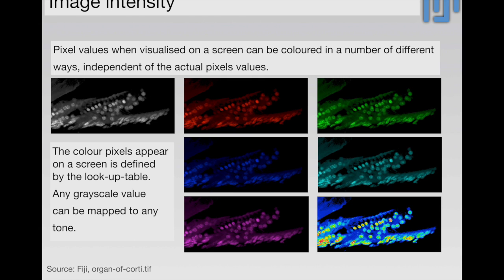And you can interchange between these very easily when it's still in the image analysis software. These ones are good, for example, if you want to show a subtle range more discreetly. We're actually less sensitive to blue than we are to green and red. So you might really want to use a kind of bluish one, but you could use these more elaborate lookup tables to map to colors which you can more easily identify within certain ranges. So it's a way of expressing the data in certain areas more vibrantly.